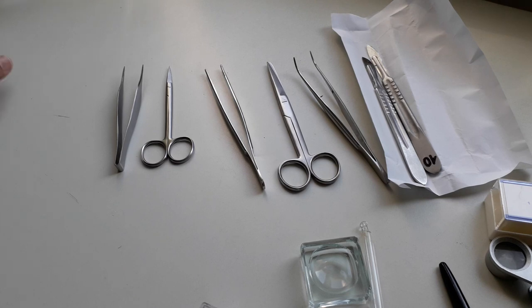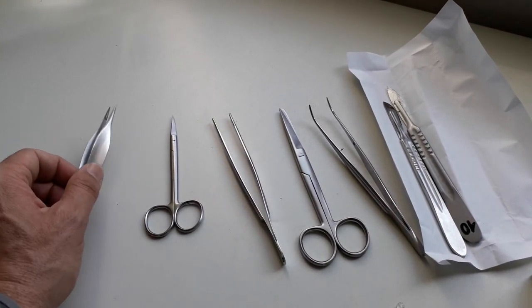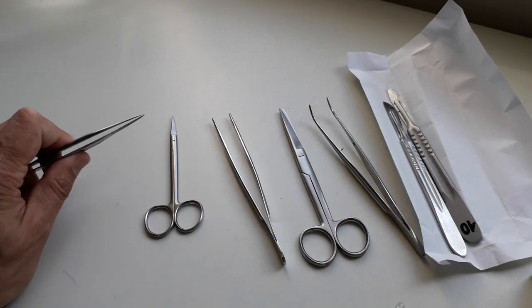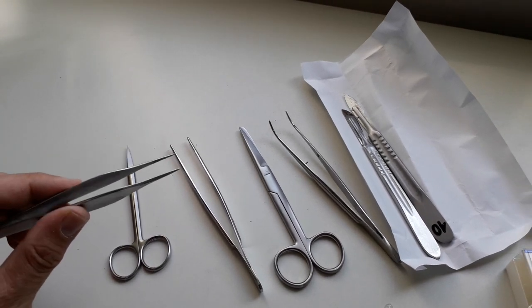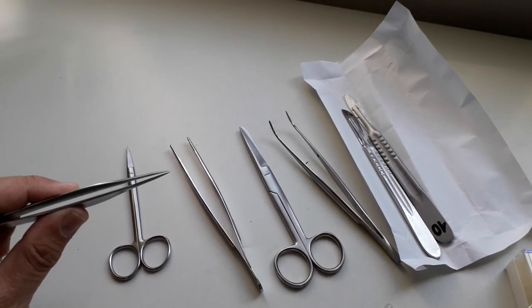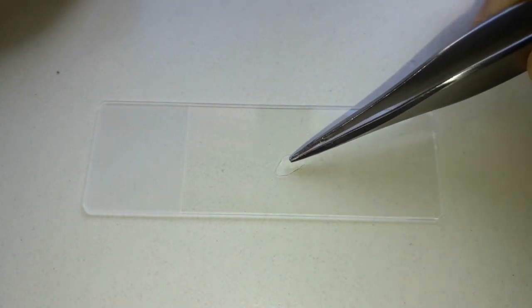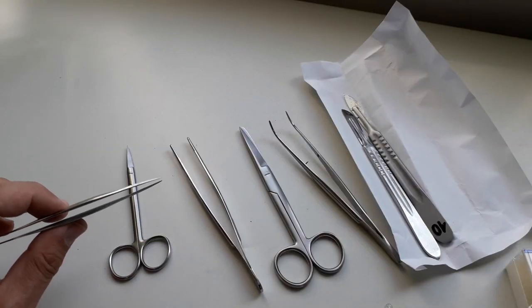And now here are the main tools that I use. Let me move the camera over a little bit. The most important tool, or at least the one that I use most often, is these pointed tweezers. They are really multi-purpose, because they can be used not only to pick up objects, but also to put down a little water drop. I can pick up some water this way and transfer it onto the microscope slide.